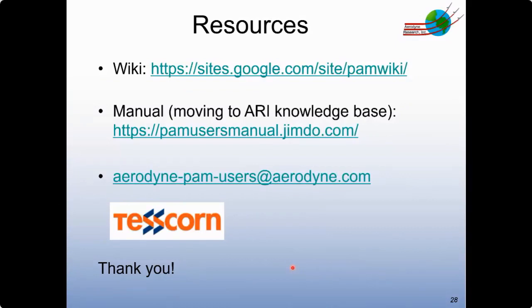I guess the only other case where it may be necessary to add humidity is if you're significantly diluting the sample. And so that can sometimes be an issue when you're sampling directly the output from combustion sources like diesel engines or flames from a controlled burn. There, it can sometimes be useful to dilute what you're sampling so you don't overwhelm not only the OFR but the instruments with a significant amount of secondary aerosols that you're generating.